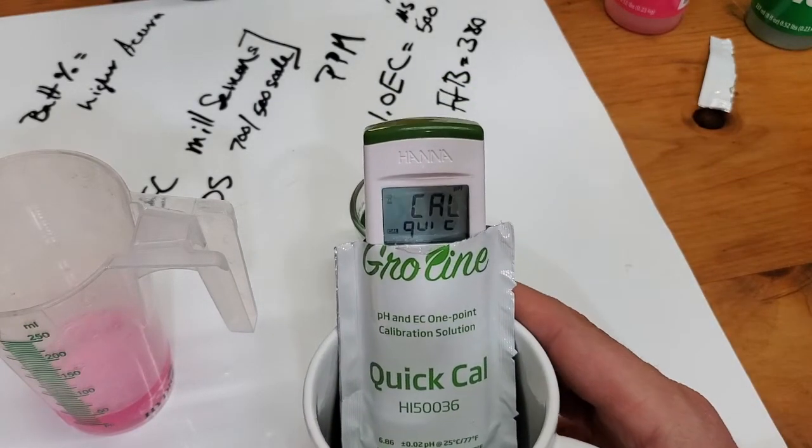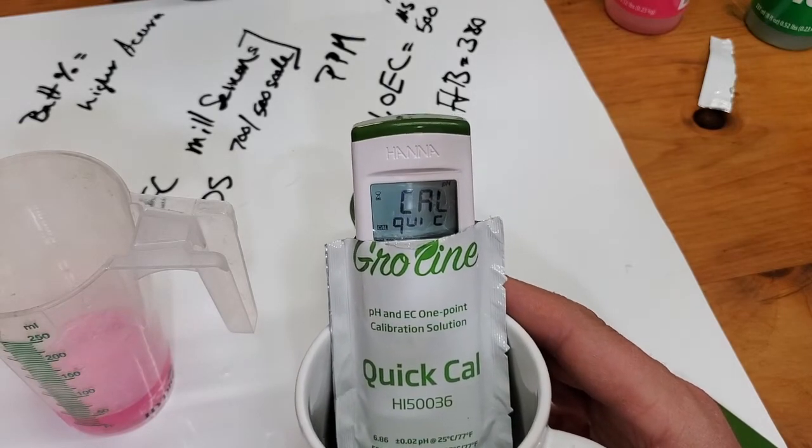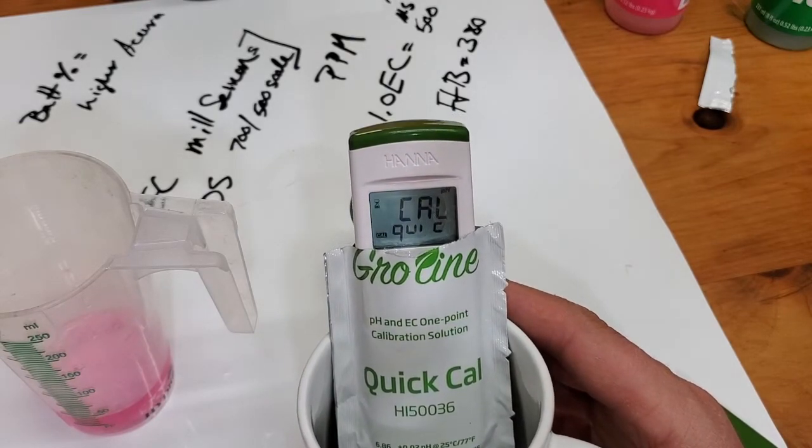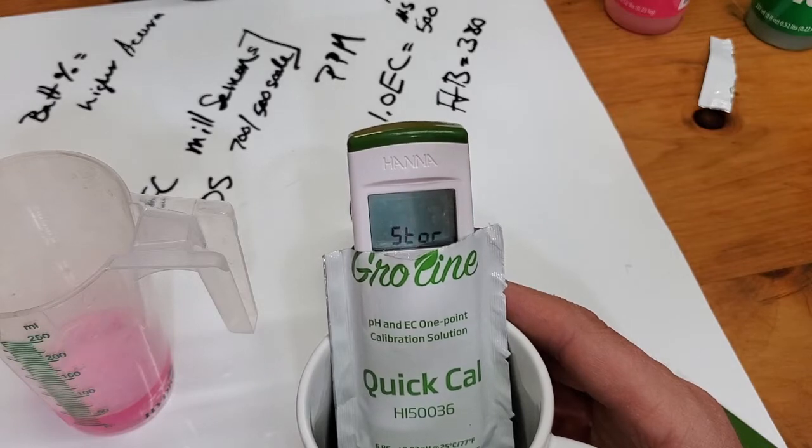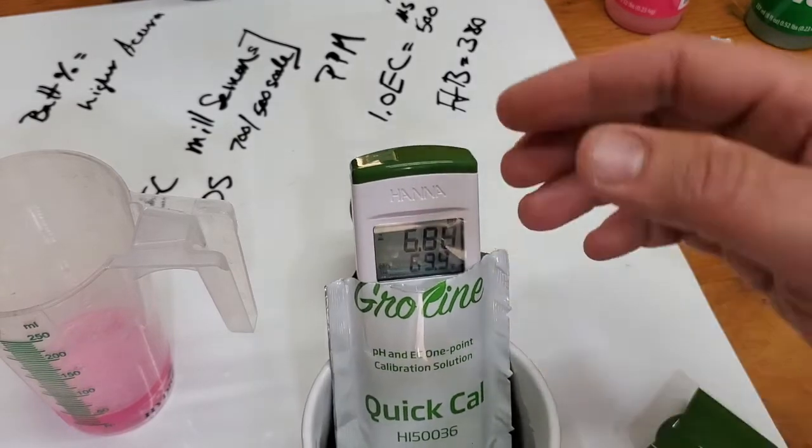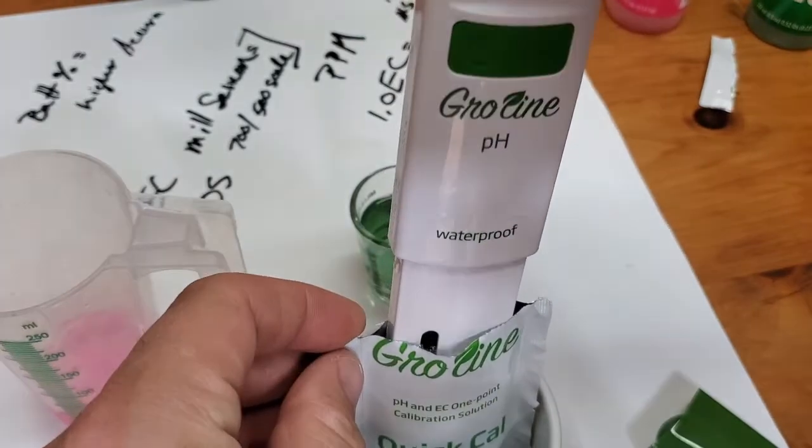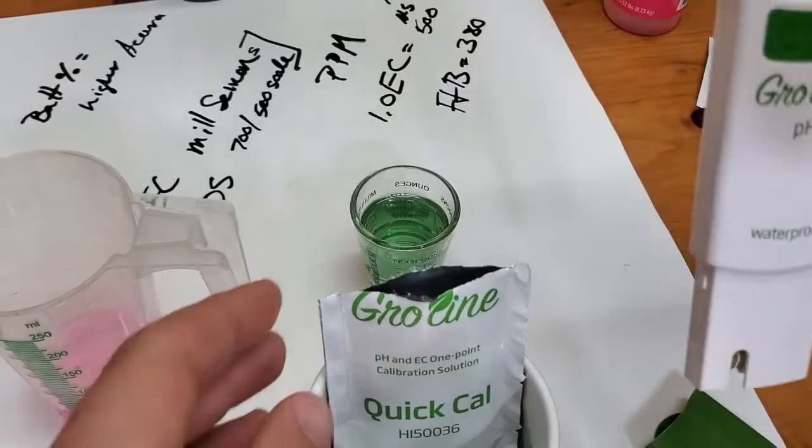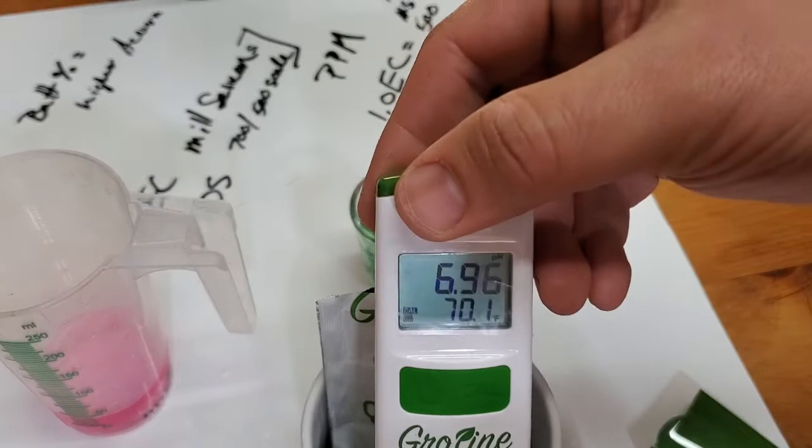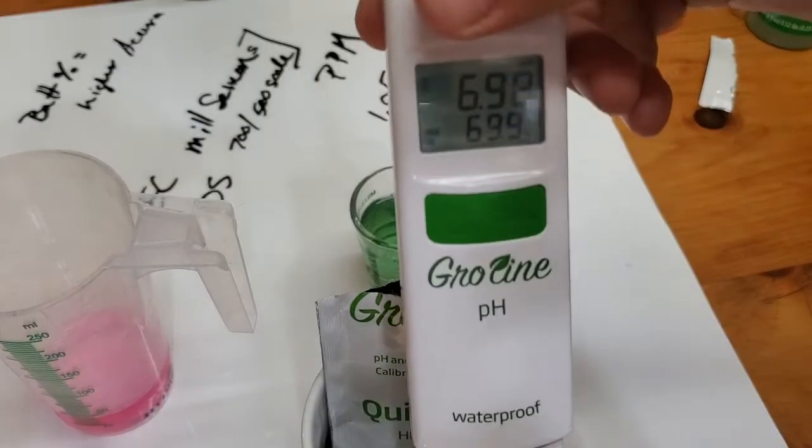This is the cool thing about the Grow Line stuff - you can calibrate with a four and seven solution. Boom, so that's set. It's calibrated, it's ready to use.